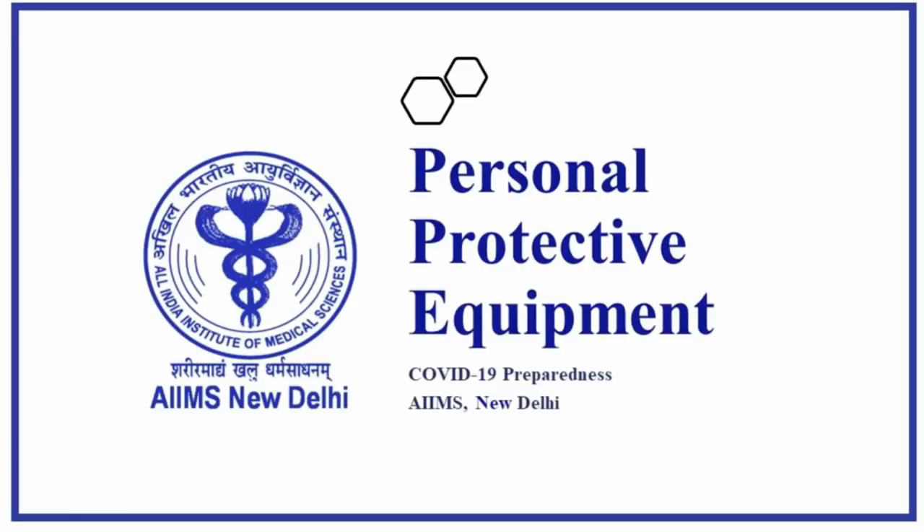Namaste. We from AIIMS New Delhi would like to demonstrate the donning and doffing methods in easy steps for protection of our healthcare workers working in COVID-designated areas.